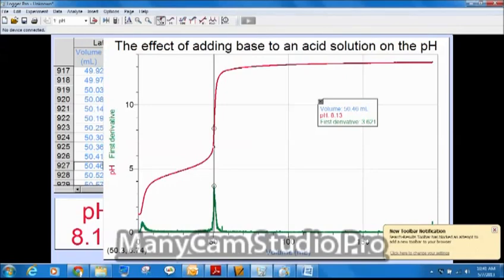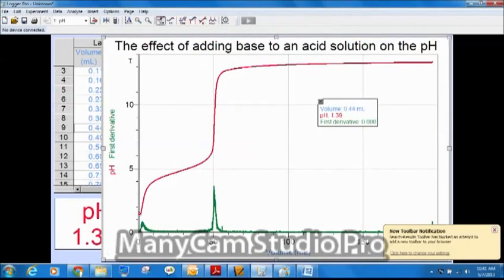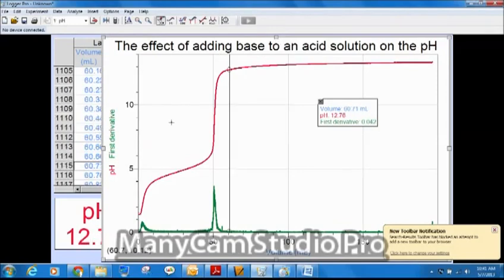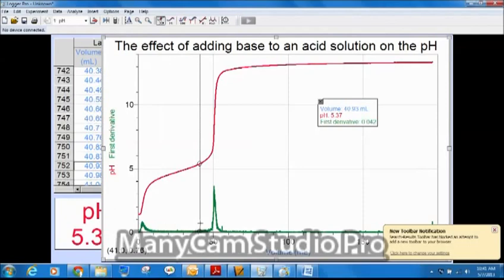Well, first thing I got to do is highlight this graph. So I got to go back off of it again, just highlight somewhere in the white space here, so that you can see in the corners now on this graph I've got boxes. Well, these boxes in the corners then mean that I've highlighted the graph. So I'm going to go back and set up my vertical examination line again. There we go. And now I want to click Control C on the keyboard. Control C on the keyboard will copy that graph.